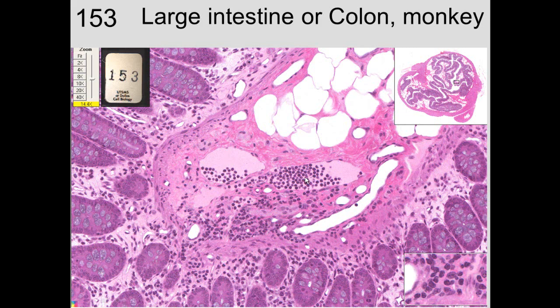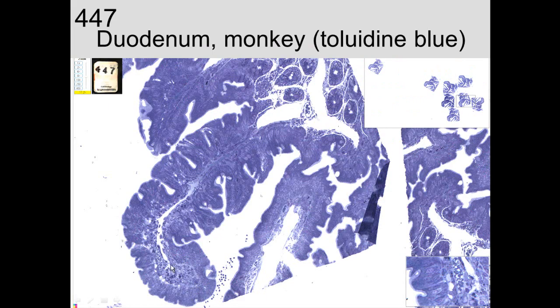Here's a lymphatic with a lot of white blood cells. These are white blood cells in through here. These capillaries here are being cleared of blood, but these are lymphatics. Lymph fluid. These are fat cells in through there. A little bit of smooth muscle going around through there. Connective tissue with lots of plasma cells in through there.